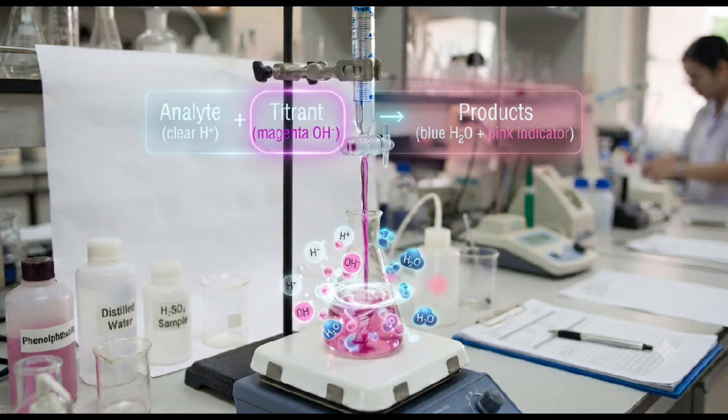Important terms. There are several important terms to remember. The analyte is the substance being analyzed. The titrant is the solution of known concentration. The burette delivers the titrant accurately. The endpoint is the experimentally observed point, indicating completion of the reaction, while the equivalence point is the theoretical stoichiometric point.